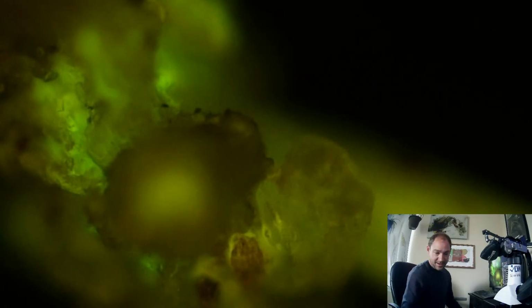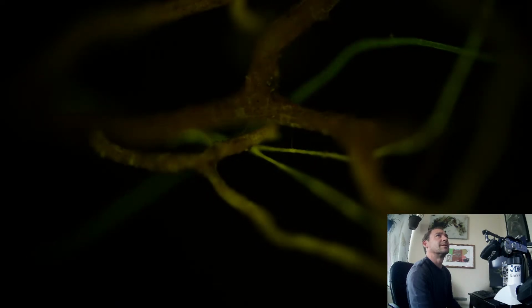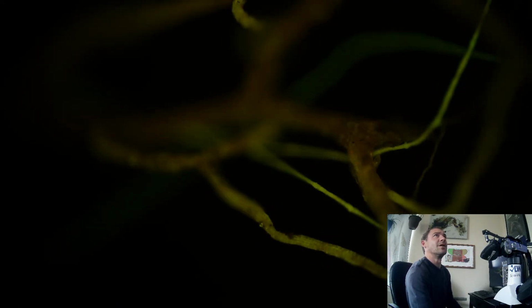Alright, so next up we got blueberry root. Scroll on down and find that one. And where are we? Blueberry root. Right about there. Alright, let's go back out to stock zoom. What's going on here? Whoa. Long root hairs.